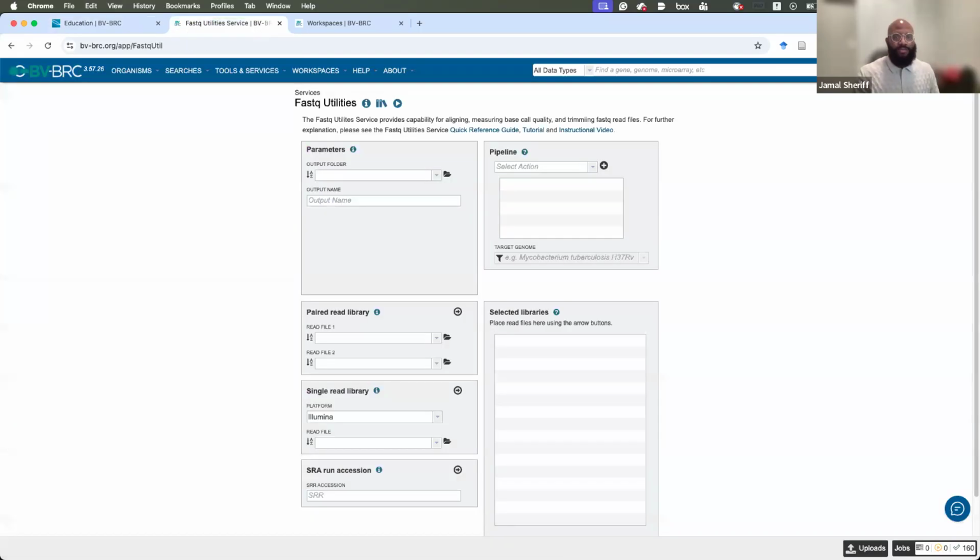All right. Now, a little background on our isolate. The data we're using is actually very high quality. We're going to make some great MAGs with our data set. Everything was completely put together by students. I got permission from Andrea Bassett at UIC, shout out, to allow us to sequence an isolate to put together this material for this workshop.